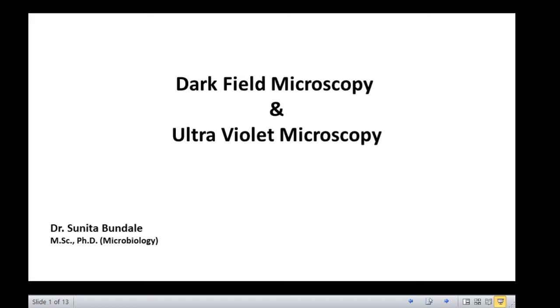Hello friends, in this lecture we will discuss dark field microscopy and ultraviolet microscopy in detail today. Let us first discuss dark field microscopy.